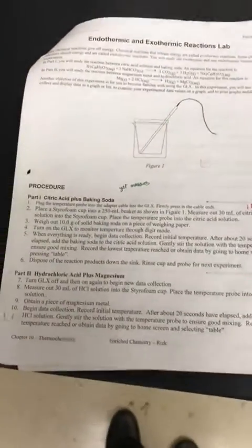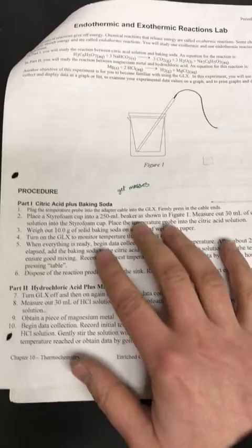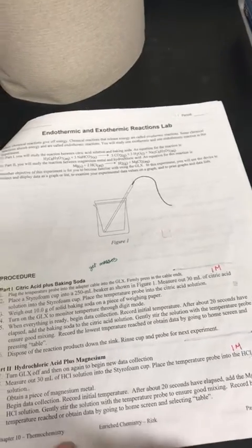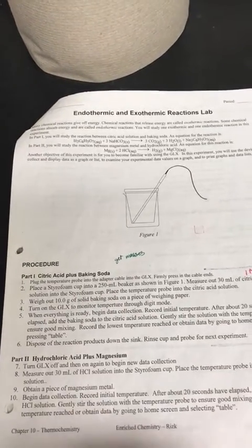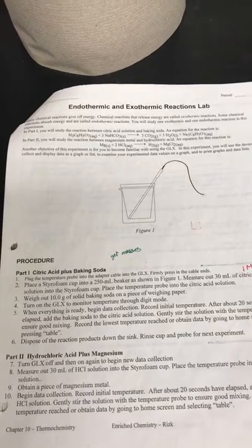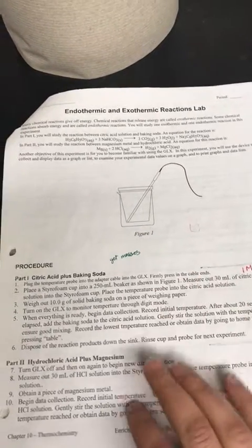So the lab is actually two parts. There are two reactions here. We have citric acid plus baking soda, and then we also have hydrochloric acid and magnesium. So you are going to work with a partner. The two of you are going to pick one of the two reactions, and then the two people across from you at the lab table are going to do the other reaction, and then you're going to exchange data so that you have data for both of the reactions. Both of them are very similar, you just use different chemicals.